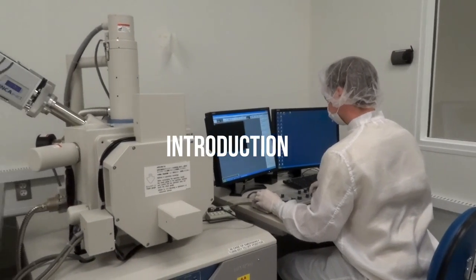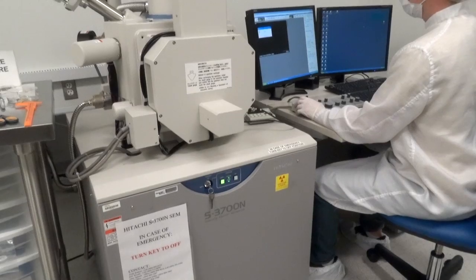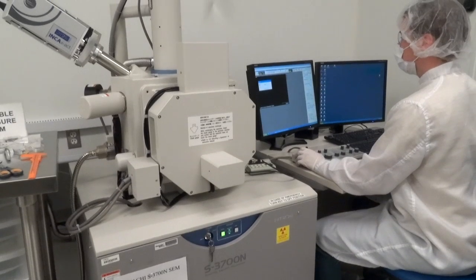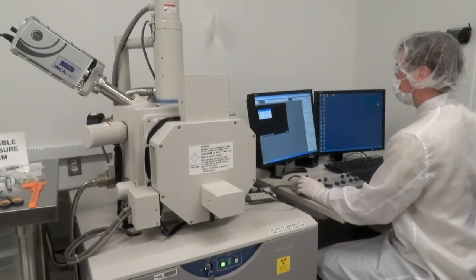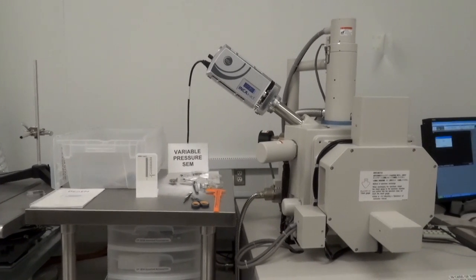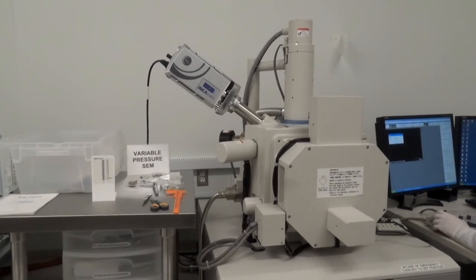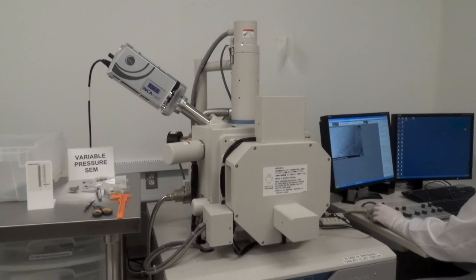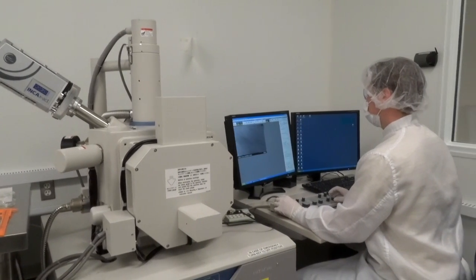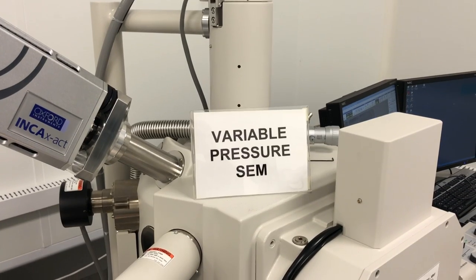The Hitachi S3700N Variable Pressure SEM features a low vacuum observation of 6 to 270 pascals, which enables imaging of non-conductive samples such as dielectrics and wet samples such as cultured cells without traditional sample preparation. A deep and cool stage controls sample temperature between negative 10 degrees Fahrenheit and 120 degrees Fahrenheit to control sample vapor pressure.